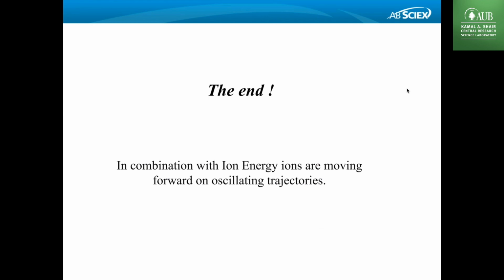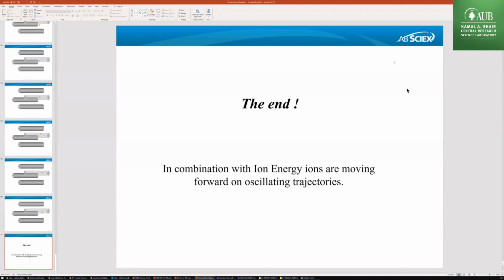Very different than a time of flight. These are very, very different types of analyzers. And that's really what's so cool about this instrument is that we're putting these 2 analyzers together and we're using the best features of both of the analyzers.